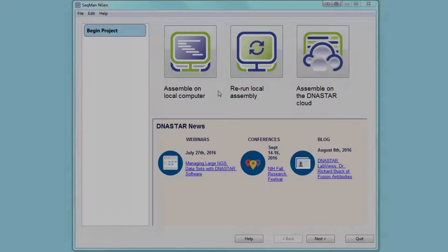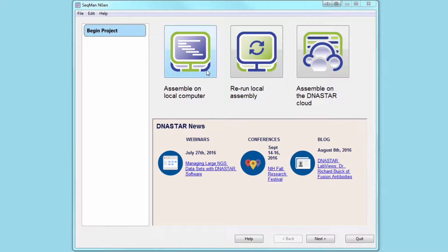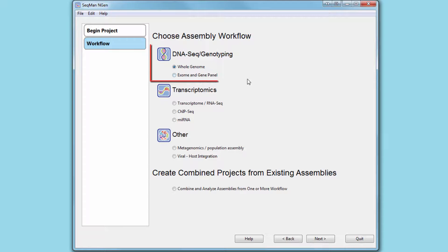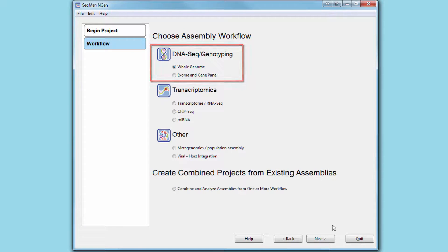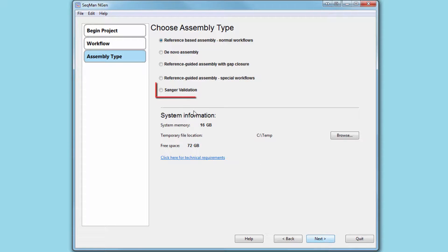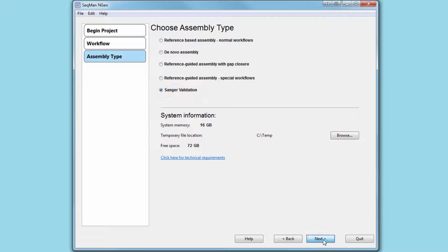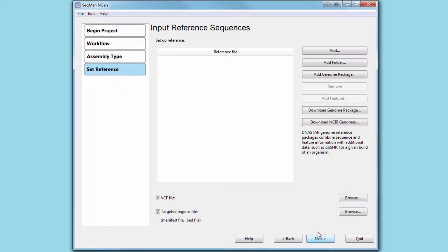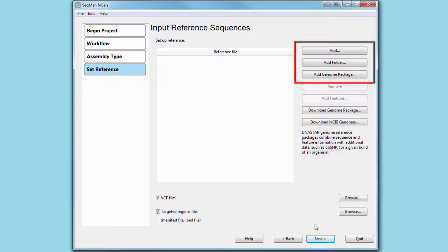To get started, set up a new assembly, selecting the appropriate DNA sequencing workflow for your project type. Next, select the Sanger validation assembly type, and load your reference sequence or template package.